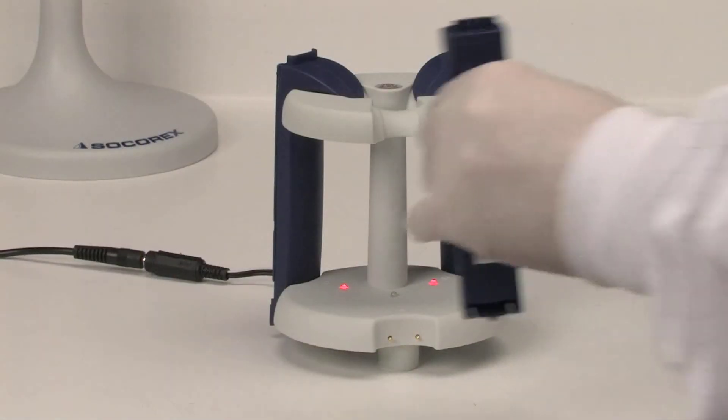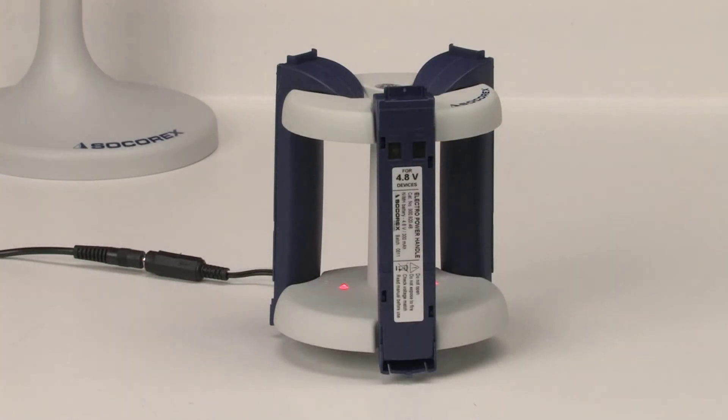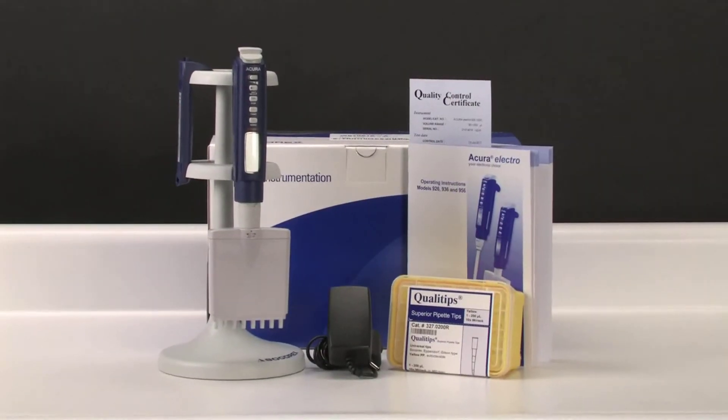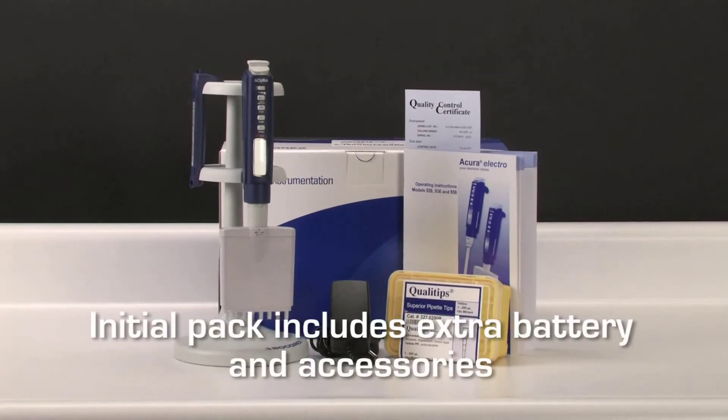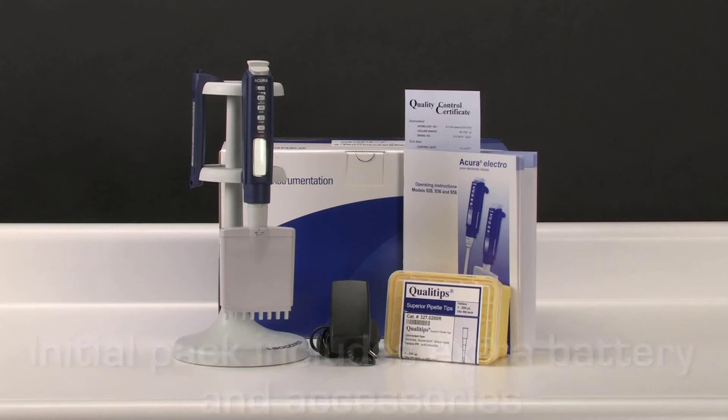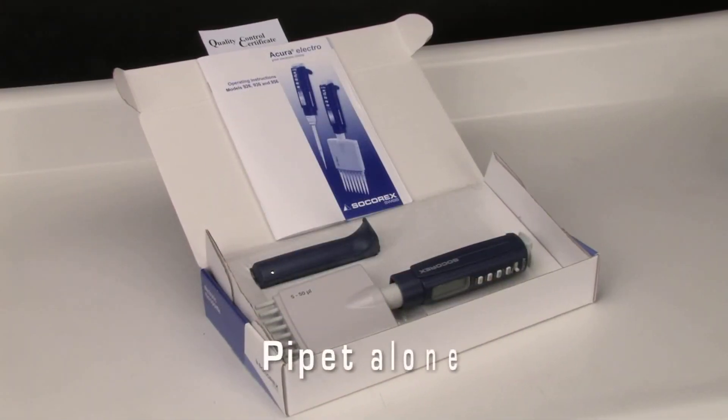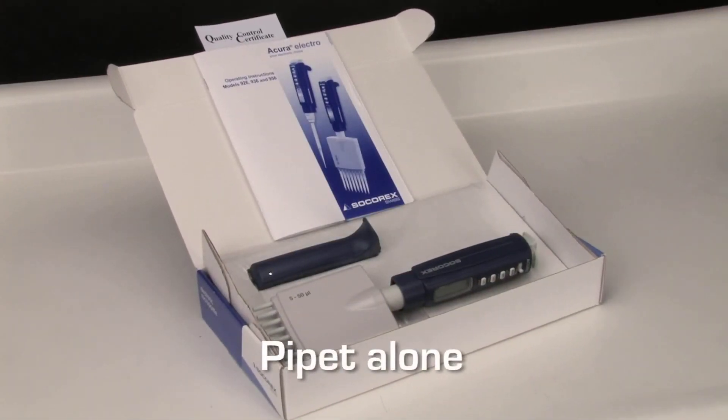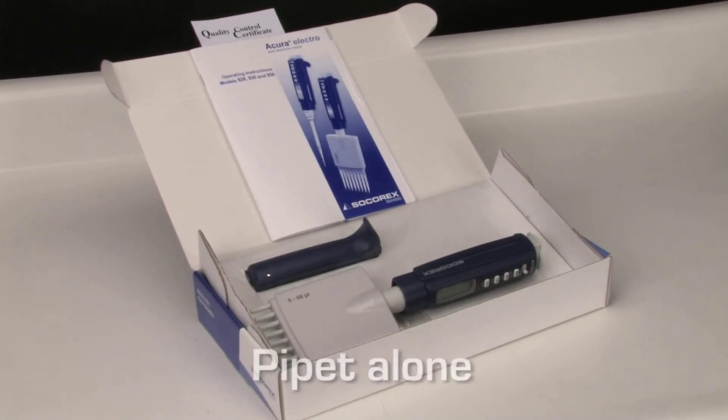The accessory battery charging rack can charge up to three battery packs simultaneously. Acura Electro is available as an initial pack, including a complete instrument and charging devices. If the charging stand is already available in the lab, additional instruments may be purchased at a lower price.